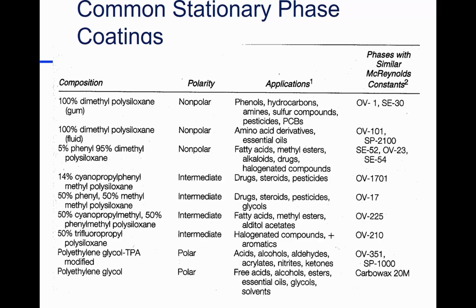If you have a really tough separation, you want to separate isomers, cis and trans, closely related fatty acids in really tough, complex mixtures, you're going to be working with this. But that column isn't very stable. It'll last a year, two years, and then you have to spend another $600 on another column. It does the job for you. You may have to use it.